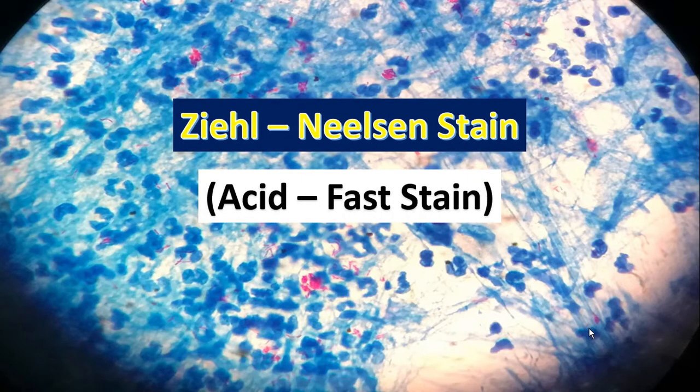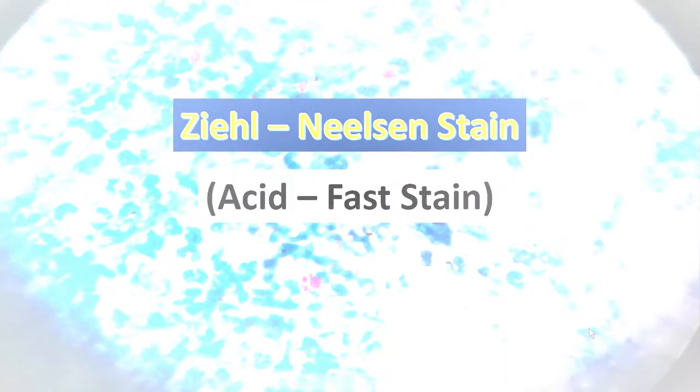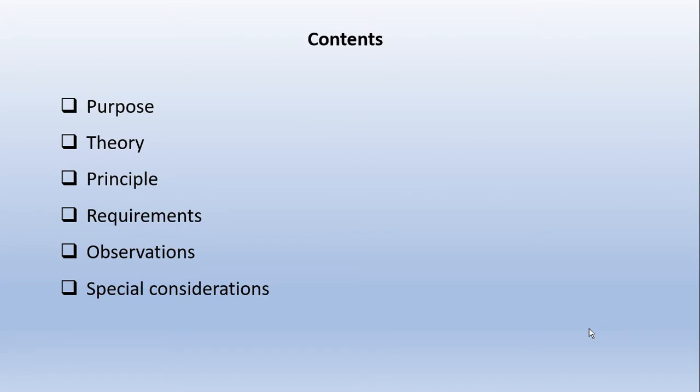Today I am going to talk about Ziehl Neelsen stain or acid-fast stain. After watching this video, you will know about the purpose of the stain, theory behind the stain, principle, requirements, observations, as well as the special considerations you need to follow when staining with this procedure.